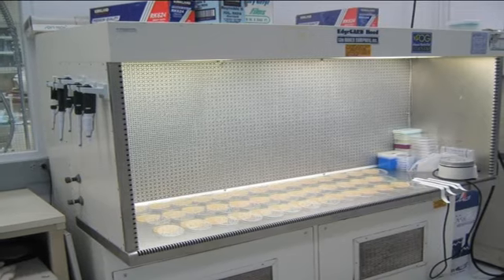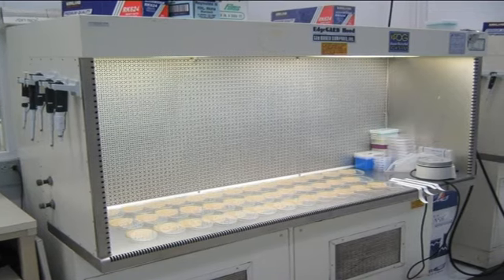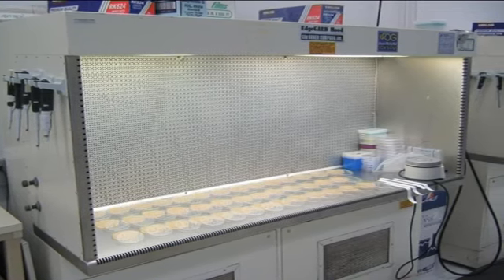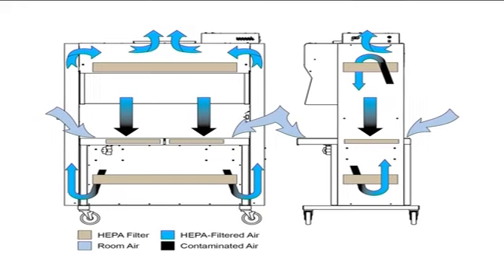Let us discuss what is laminar airflow cabinet. Laminar airflow is a type of fluid such as gas or liquid flow in which the fluid travels smoothly or in regular paths, in contrast to turbulent flow in which the fluid undergoes irregular fluctuations and mixing. In laminar airflow, sometimes called streamline flow, the velocity, pressure and other flow properties at each point in the fluid remain constant.